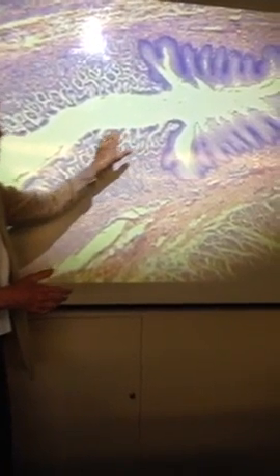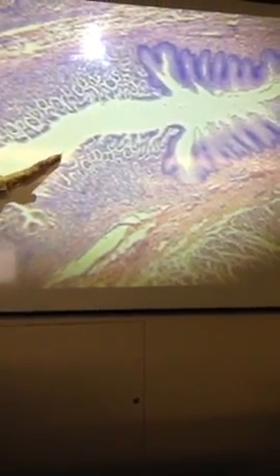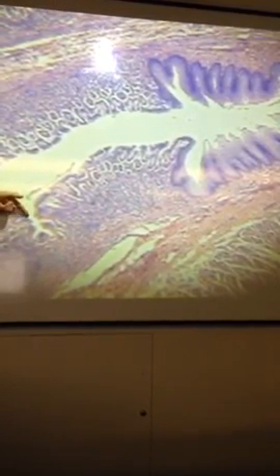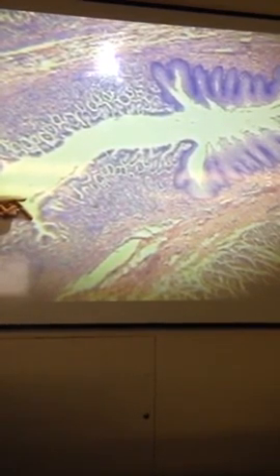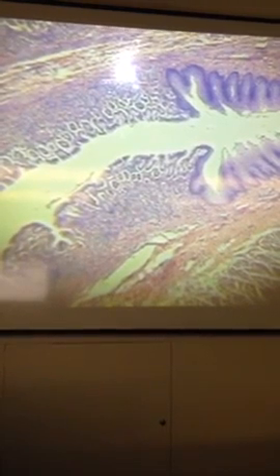So usually I have this at the next magnification on the lab practical so that you'll be able to see now we have simple columnar cells lining the stomach. It would have a coat of mucus. We lose that in the preparation of the slide. And now here's a large gastric pit right here. So the lining of the cardia of the stomach would be smooth, except for these gastric pits. And the gastric pits move down and form a gastric gland.